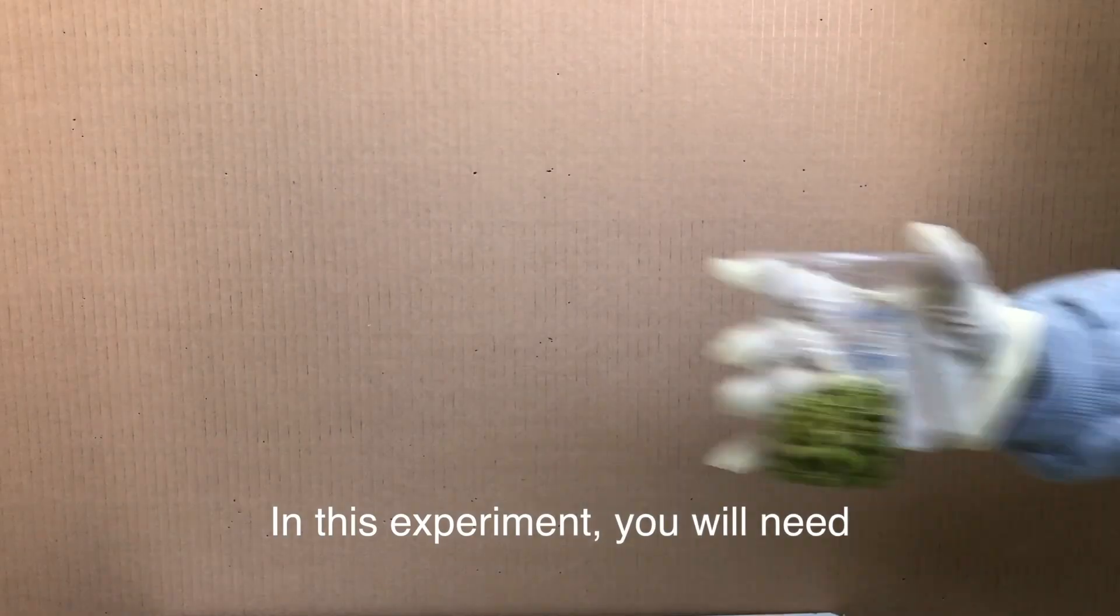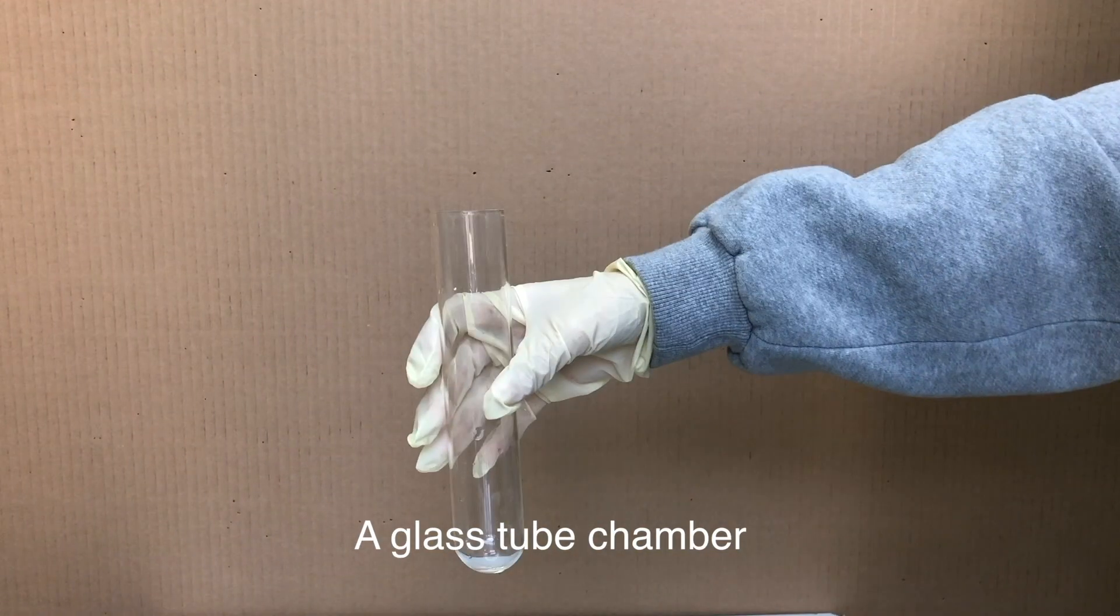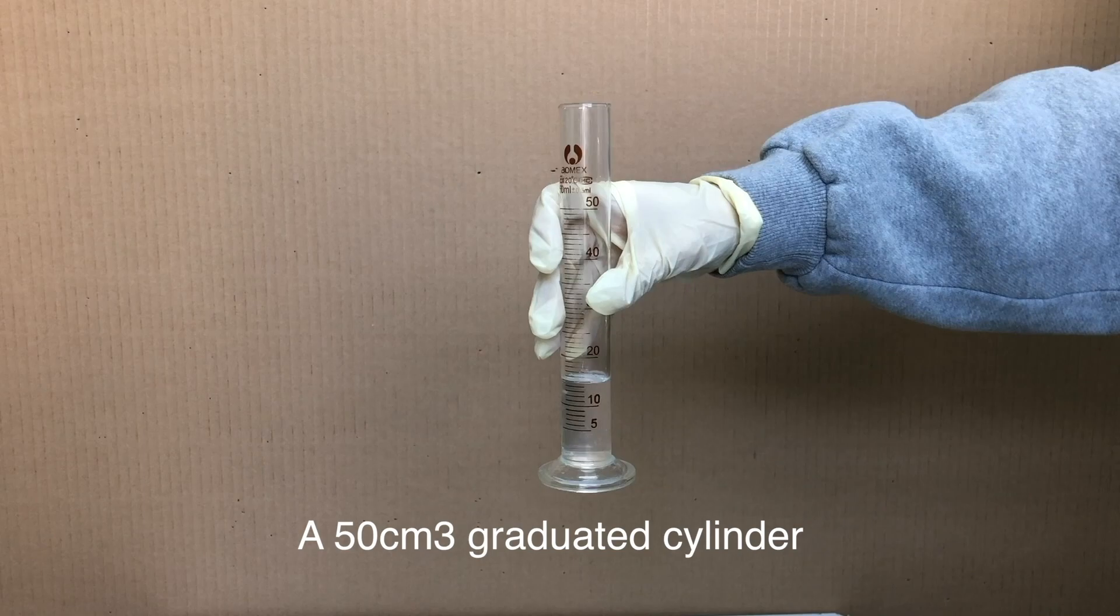In this experiment you will need mung beans, a metal ring stand, a glass tube chamber that looks very similar to a test tube, and a 50 centimeter cubed graduated cylinder.